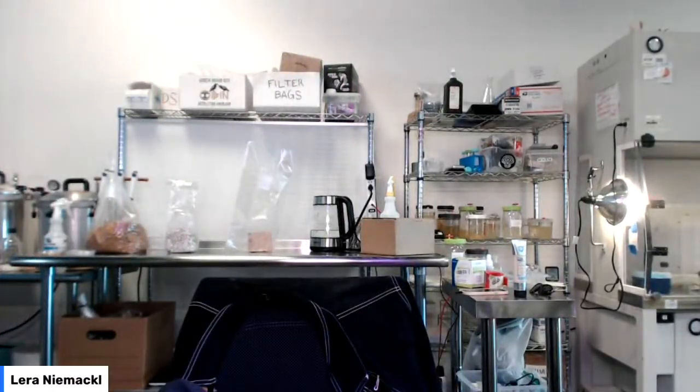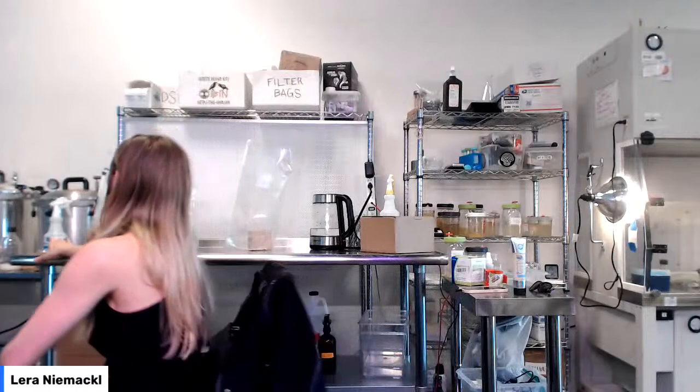Alright, 17 people — good enough. So before we jump into the lecture side, I'm going to show you the agar plates that I made last time, to kind of show you what they should look like at this point, both as a blank plate and for stuff that you did from culturing.